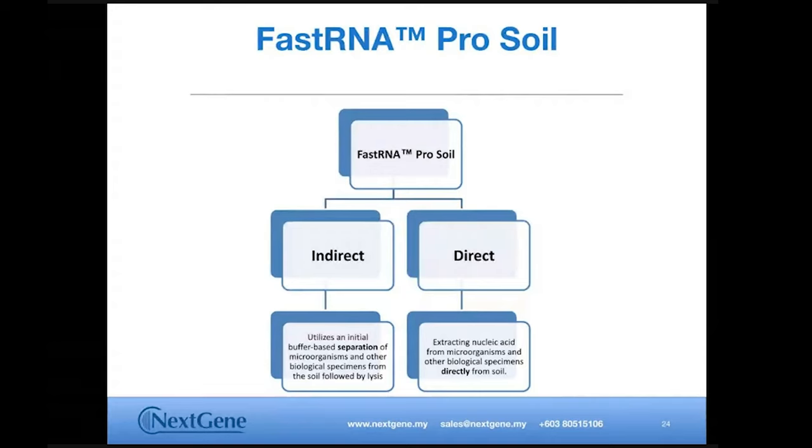Okay, so the first link that I share is a journal with the title Spatial Distribution of Below Ground Mycelia of Ectomycorrhizal Fungus Inferred from Specific Quantification of its DNA in soil sample. So basically they extract DNA from soil sample and then try to detect the quantity of the fungus in the soil. The second one is not directly checking on the mushroom itself, but checking on the bacteria community that lives near the mushroom. They look at the bacterial community by extracting the DNA and checking on those bacteria living alongside the mushroom.